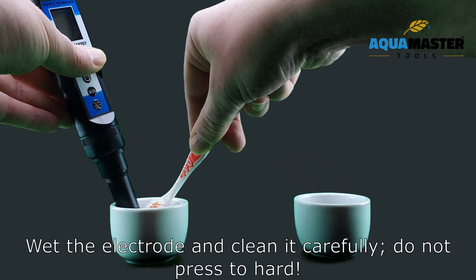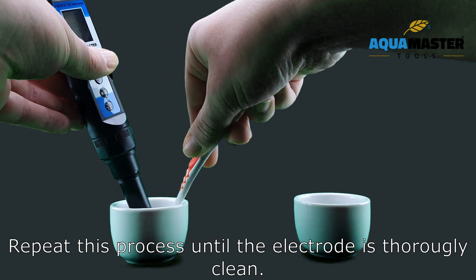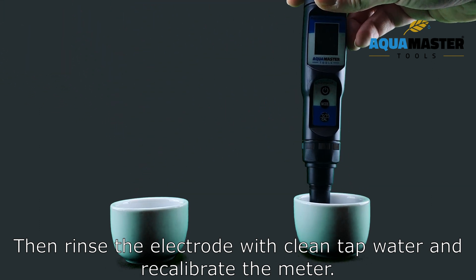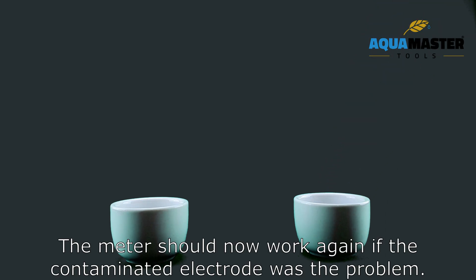Wet the electrode and clean it carefully. Do not press too hard. Repeat this process until the electrode is thoroughly clean. Then rinse the electrode with clean tap water and recalibrate the meter. The meter should now work again if the contaminated electrode was the problem.